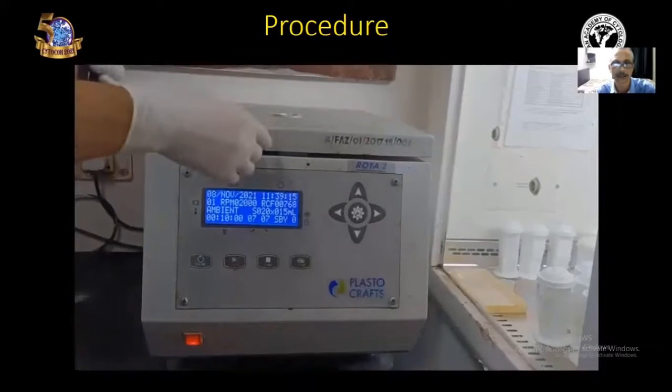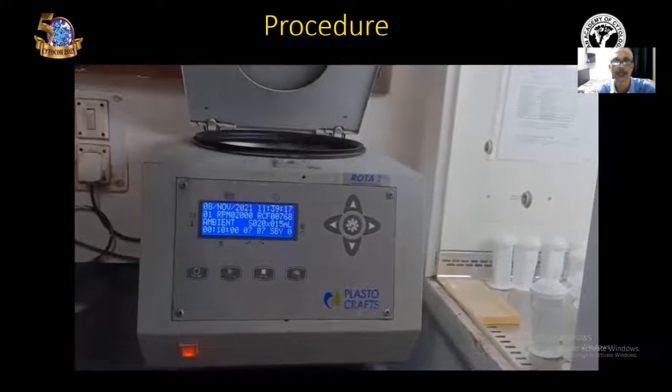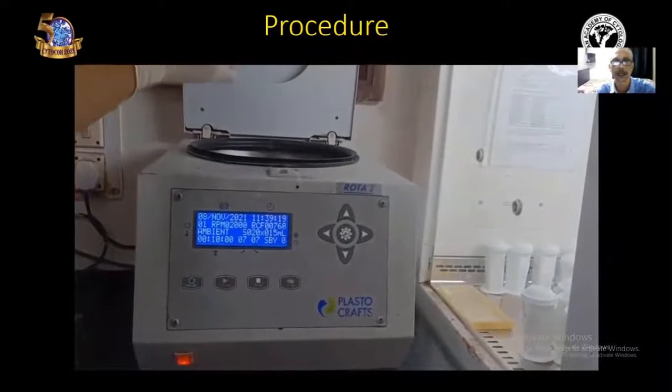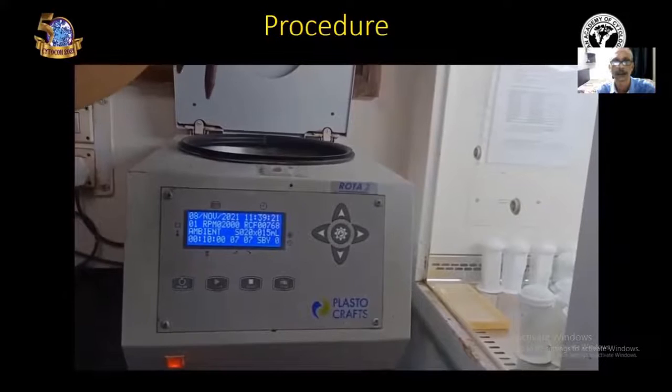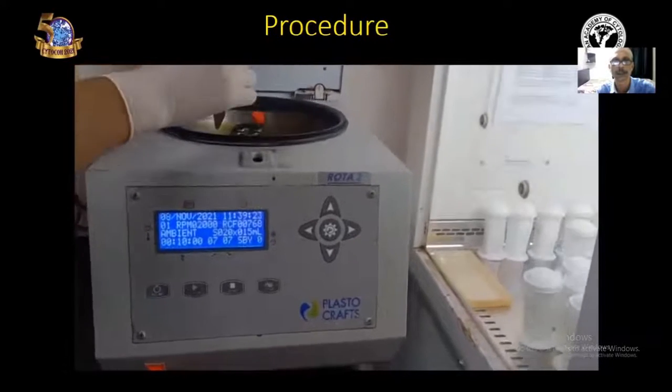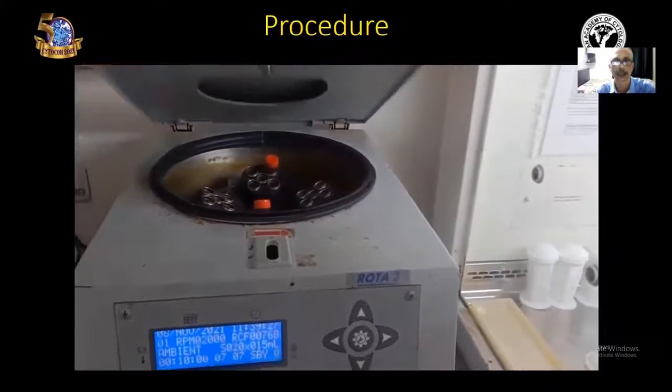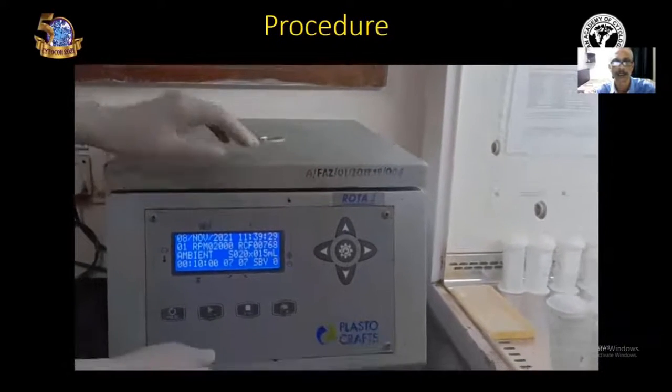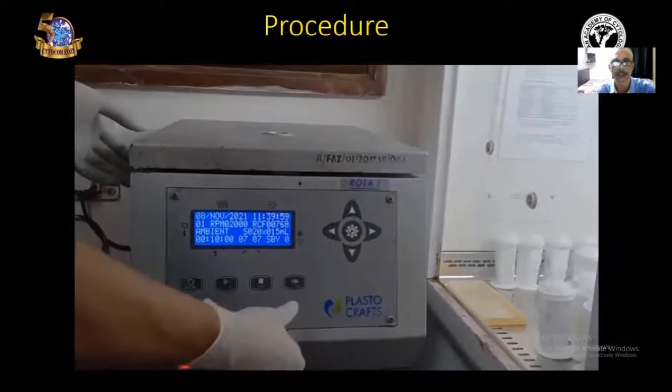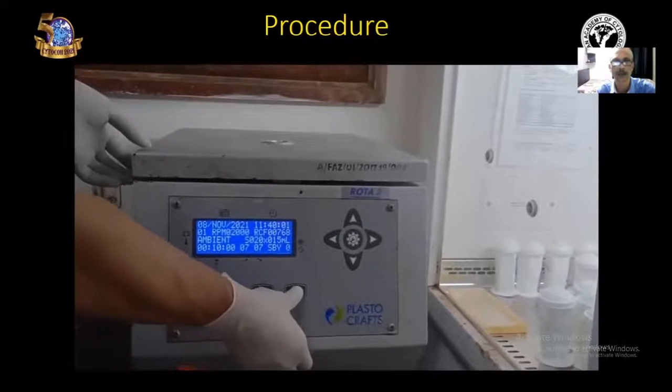Next step is centrifugation. Take the sample to the centrifuge machine and keep it in opposite chambers. Close the centrifuge machine and start the machine. Centrifugation is done at 2000 RPM for 10 minutes.